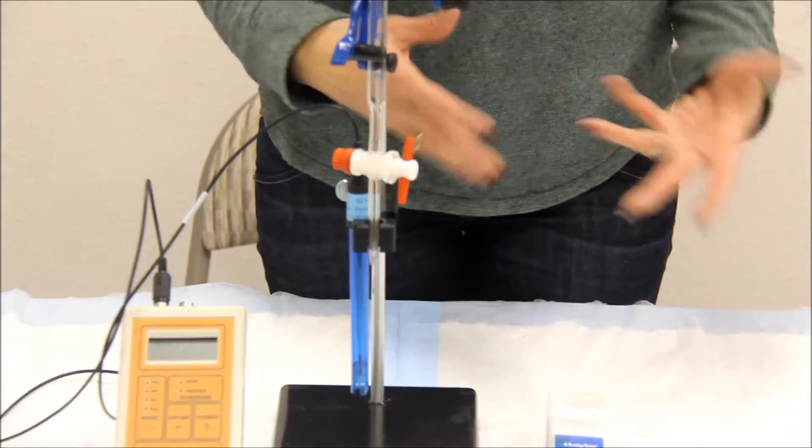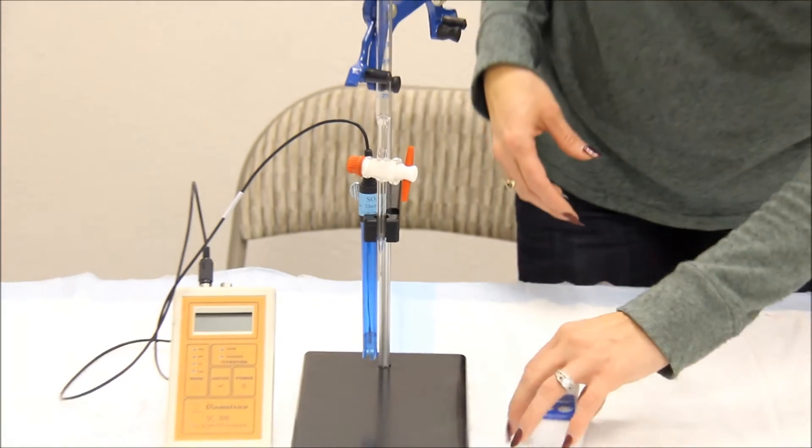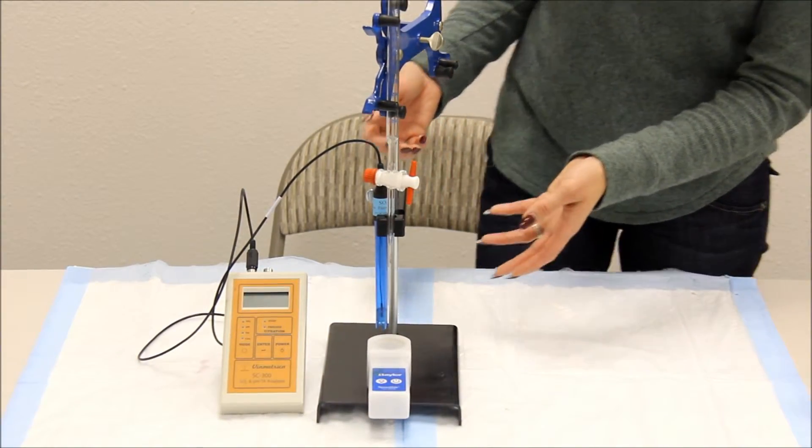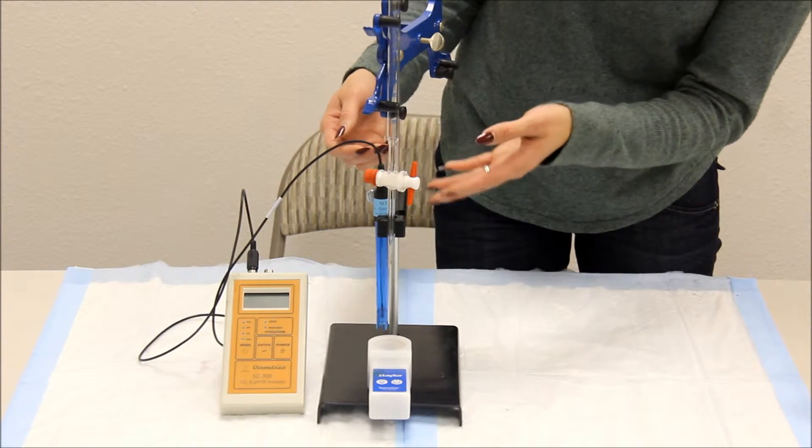You are now ready to add your wine samples. You may need to adjust the height of your electrode holder and burette clamp.